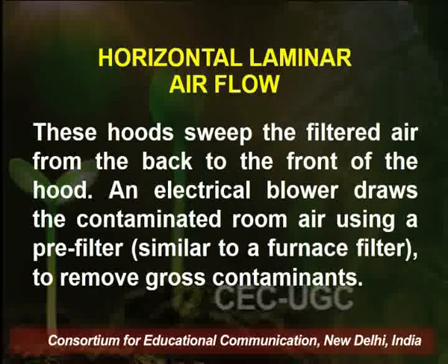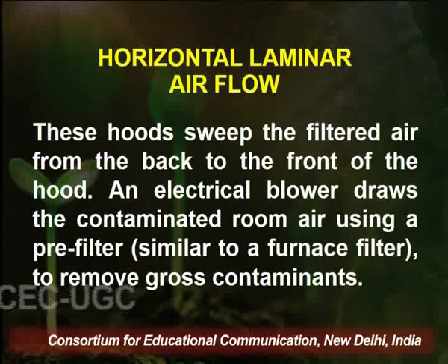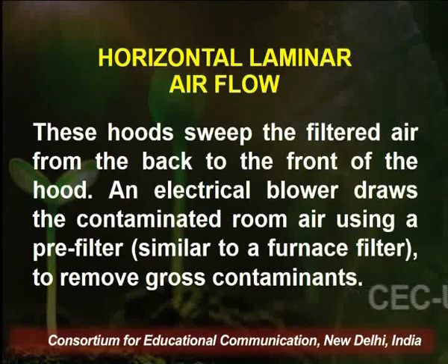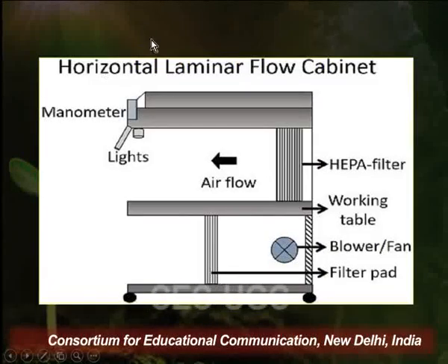These hoods sweep the filtered air from the back to the front of the hood. An electric blower draws the contaminated room air using a pre-filter, which is similar to a furnace filter, to remove gross contaminants. A horizontal laminar flow cabinet can be understood with the help of this schematic diagram.